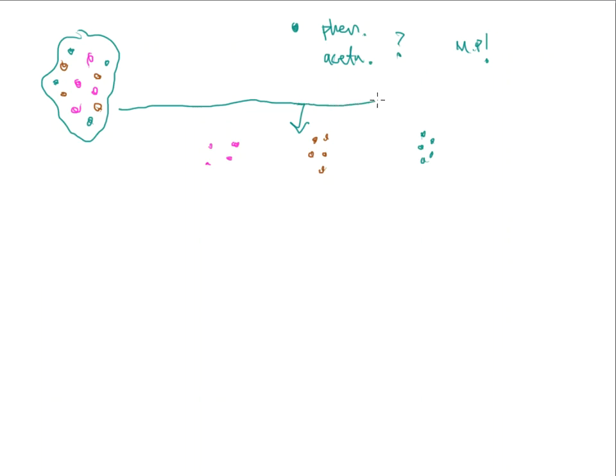So the very first one will separate these things out into the clean individual components, and then we can do testing with them from that point on. Once I do this, I will have an isolated unknown. And now I can do the melting point in order to determine which one it is. But I have to make it to that point first.